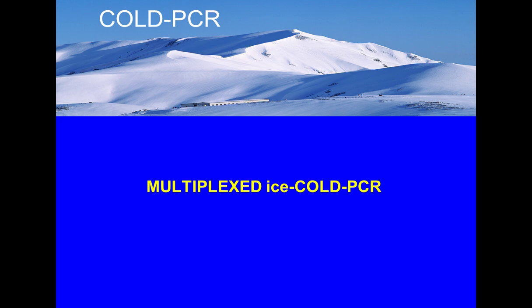So in the last few minutes that are remaining, I would like to mention the latest developments of the technology: multiplexing ice-cold PCR.